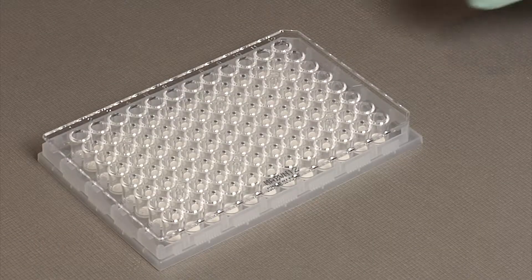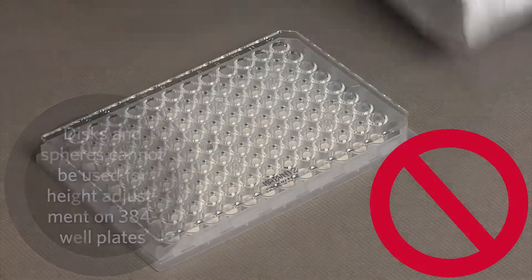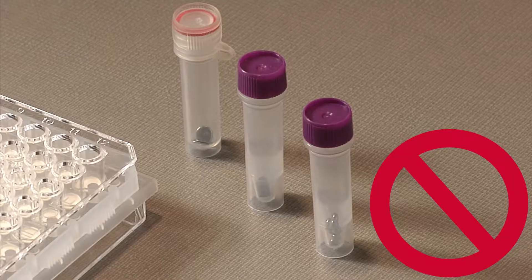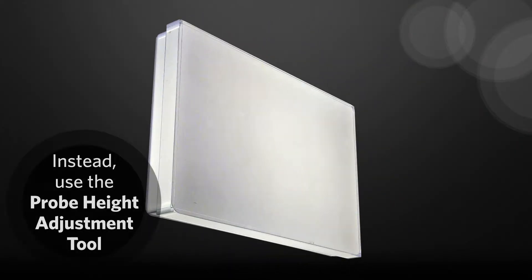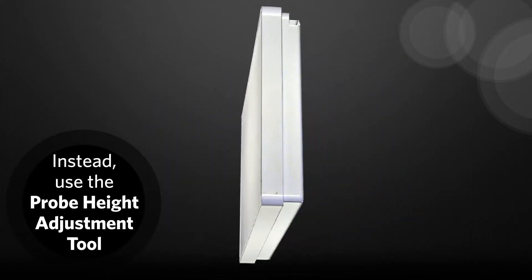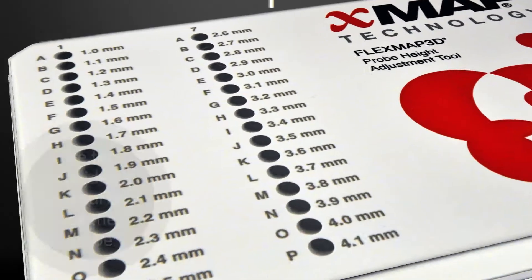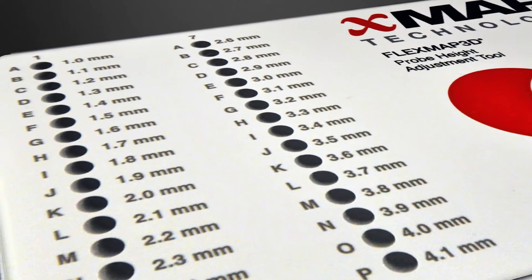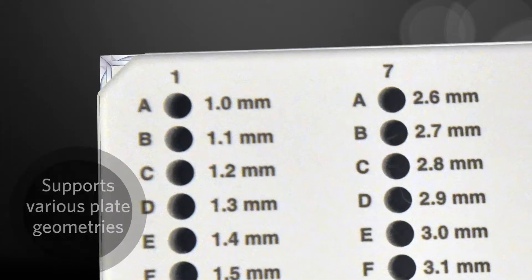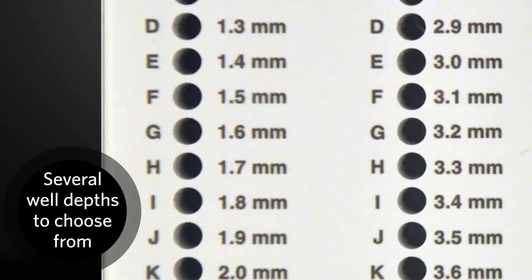Why should I use the tool? Unlike 96 well plates, 384 well plates cannot use discs or spheres for probe height adjustment on soft bottom plates. Therefore, Luminex created the probe height adjustment tool for use with a wide range of 384 well plates. The tool provides a hard bottom surface for probe height adjustment. In order to account for different plate geometries, for example plate skirt height, the tool has several adjustment wells to choose from.